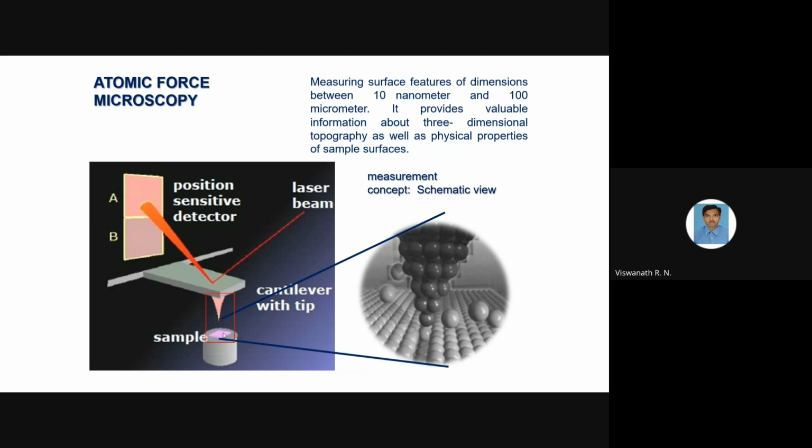So it means the structure has changed, whether it is removal of atoms, addition of atoms, or an impurity atom is there. All this information comes from the force varying. For that, the reference state is fixed at the beginning where everything is fine. Because we cannot do this manually, it is all done by computer iteration.